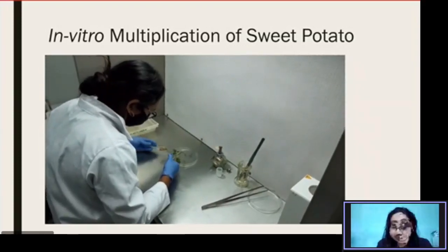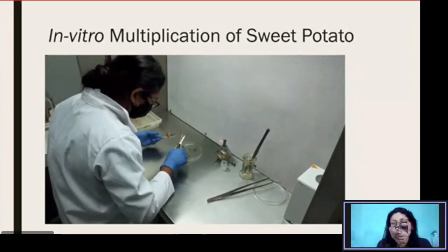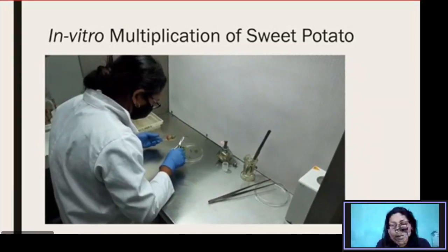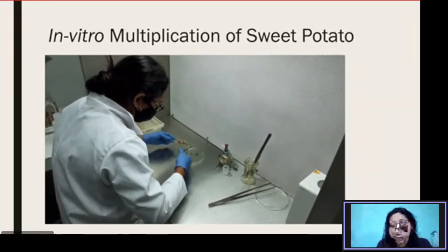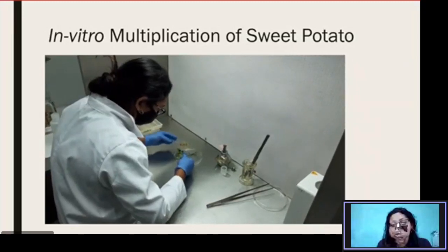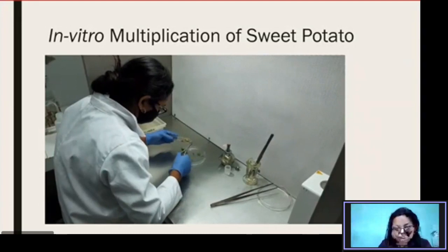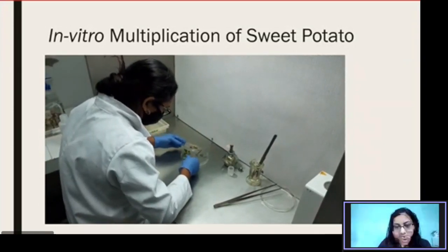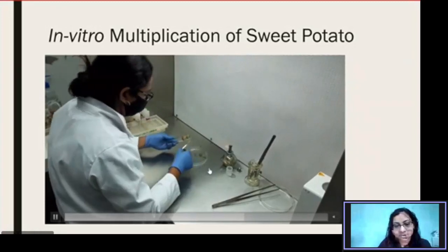You have to remember the orientation of the plant. So what I usually do is I make the bottom part under the node a little longer than the top, so I know which part has to go into the media. And so from this single explant, you see how many nodes I'm getting there?